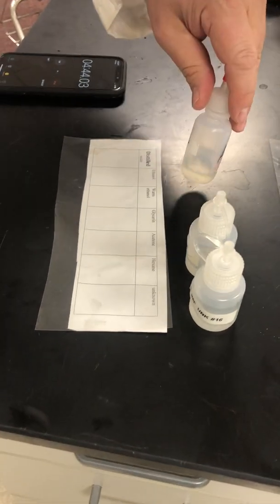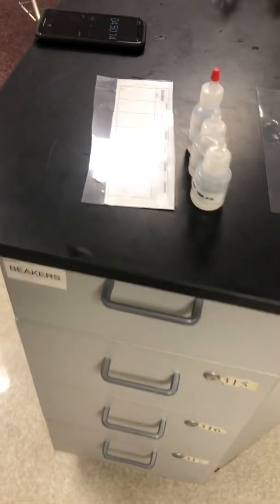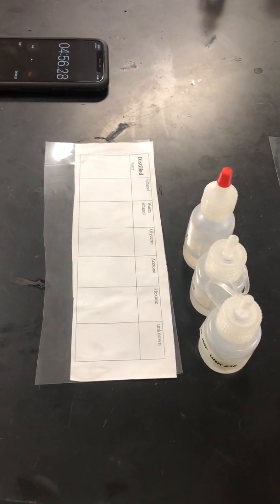So we've got unknown number 16 here. Hexane, I think this is the one that you're going to have some fireworks on. Acetone. And warm ethanol. So again, over 5 minutes, we have water and glycerin still there.